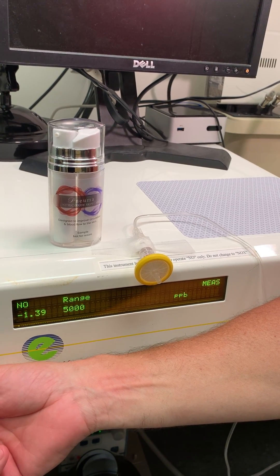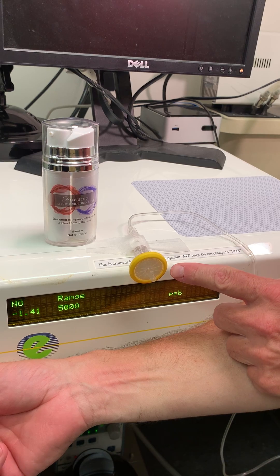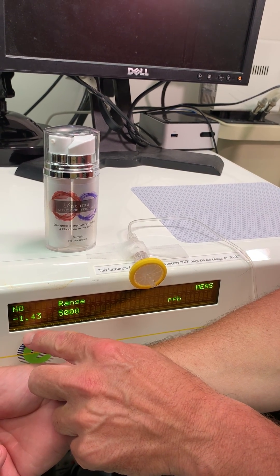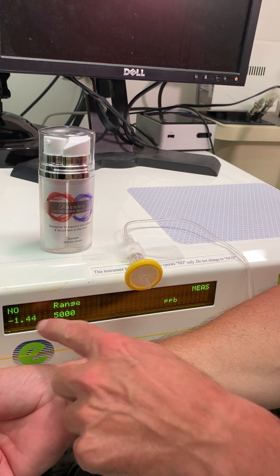We're here in the lab, and this is a nitric oxide analyzer. This is a gas phase nitric oxide detector, and this will be the readout of nitric oxide. So when nitric oxide goes up, you'll see these numbers change.